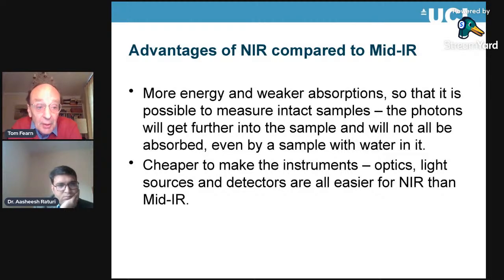If you want to use mid-IR and look at the fundamentals, then you have to dry samples, because otherwise the water will absorb just about everything that you put in, and you just won't see anything back. So NIR enables you to look at samples that have got water in, wood being one example. That's got quite high water levels, and you wouldn't be able to use mid-IR on it without drying the samples out.